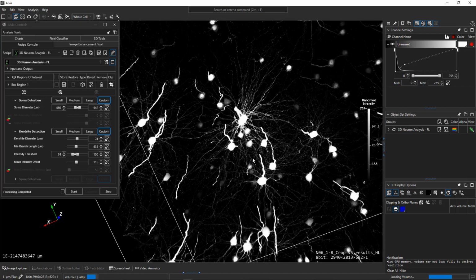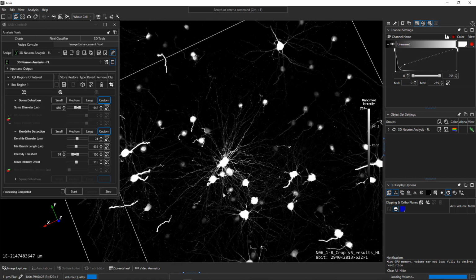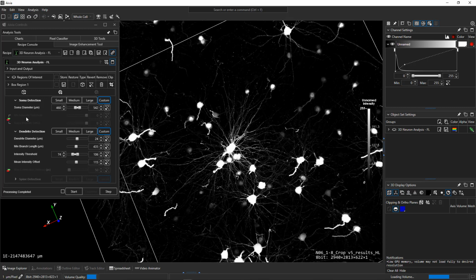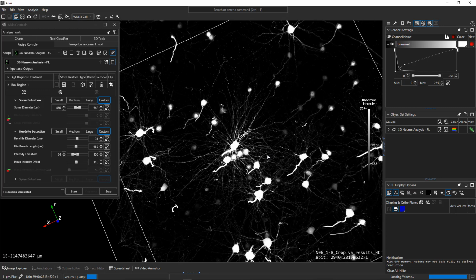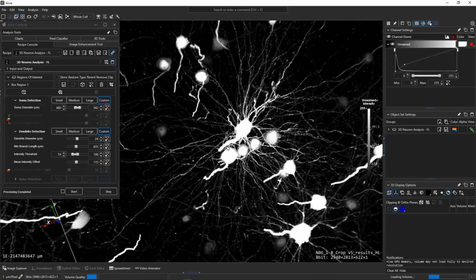as I mentioned in the presentation a moment ago, it would require a lot of human intervention and a lot of human time to get to the right parameters. The procedure would be to set up all of these parameters to something we think is reasonable, apply it to the image, and check the results. Likely it wouldn't be perfect at the first go, so we would do it again and again, multiple times, adjusting the parameters with slightly different combinations until we get to a good result. That would be the procedure. That is still the procedure for most cases.